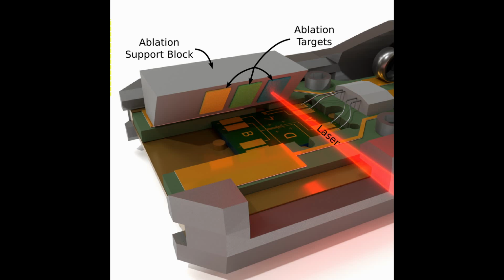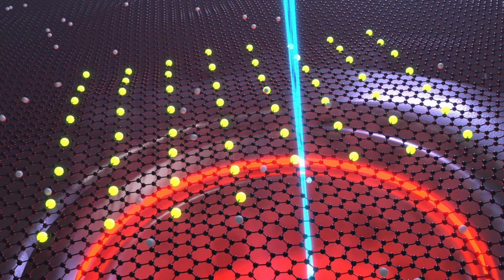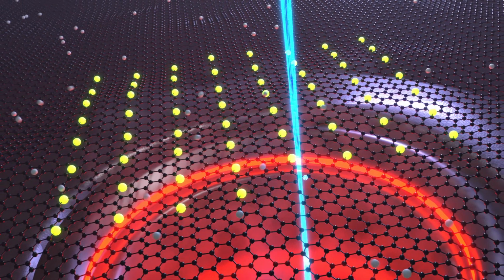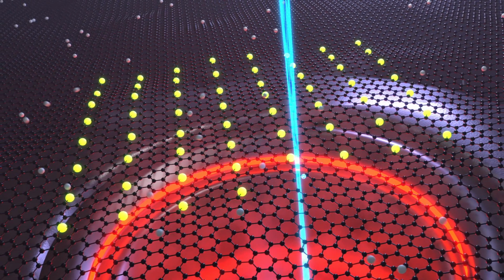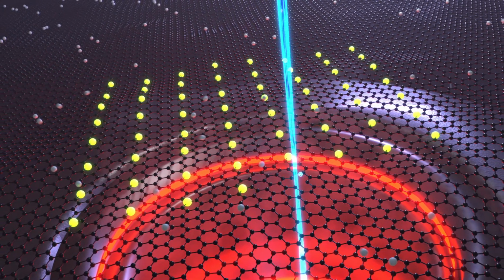Using simple strategies such as these, we believe that atomic scale synthesis processes could become a matter of routine. Coupled with automated beam control and AI-driven analysis and discovery, the synthoscope concept offers a unique approach toward atomic scale manufacturing and a window into atomic synthesis processes generally.